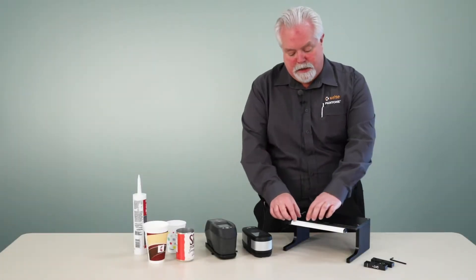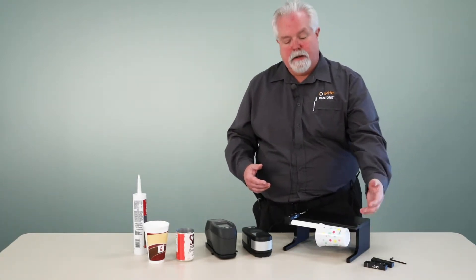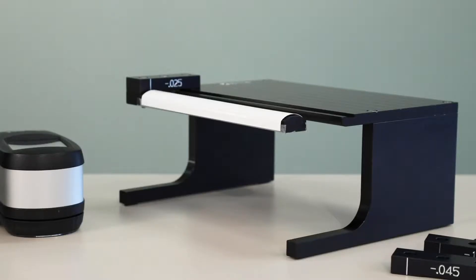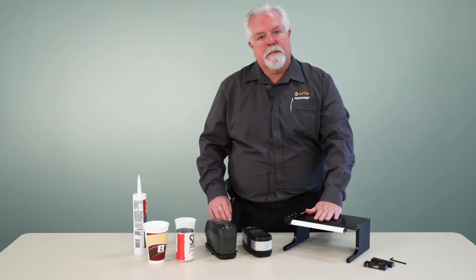The way that this device works, there is a sample arm that we place the item over. We simply take the object that we're measuring and place it over the arm. We have a Munsell backing material on the arm, which gives us an opaque ISO spec backing material for our sample. We have a height adjustment block, which is used to set the height of the arm so that the surface of the object we're measuring is in the same plane as the bottom of our instrument.